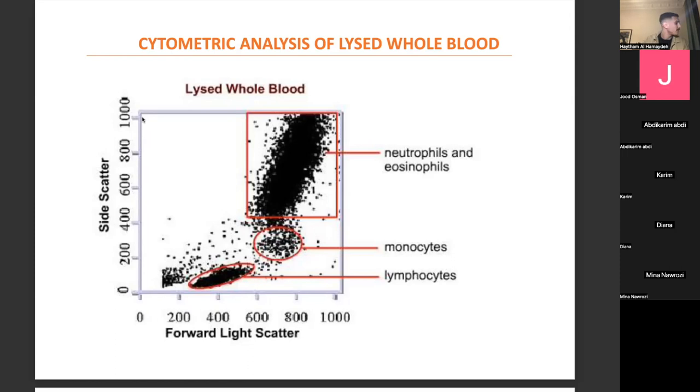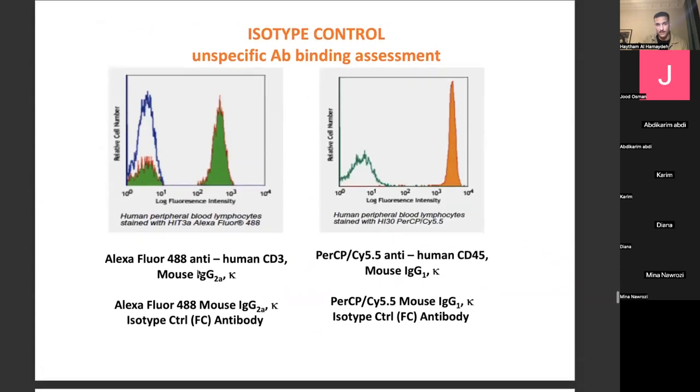Down or up? Down. Why? Because side scatter measures granulation. Less scattering means fewer granules inside it, so a lower granulation value for monocytes. This is why different cells, with different granulation and different sizes, are situated and labeled on this graph in different positions. Both are quantities that should be combined because it's one cell. I hope this is very clear.